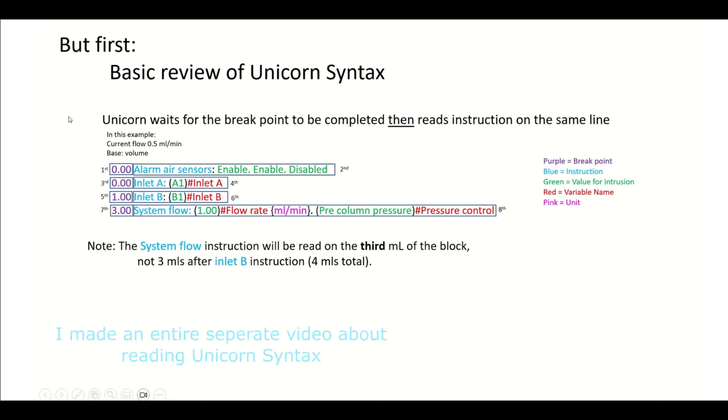In this example, we want to understand that unicorn waits for the breakpoint to be completed and then after that it reads the instruction on the same line. We're focusing on the purple and the blue. The time at which it's read is in purple, the time or volume at which it's read is in purple, and the instruction itself is in blue. Everything after that is either a variable, a unit, or the name of the variables. Because it says zero here, unicorn is just going to read straight through that and then complete the instruction for the alarm air sensors.